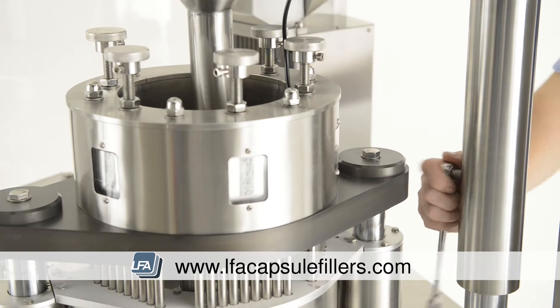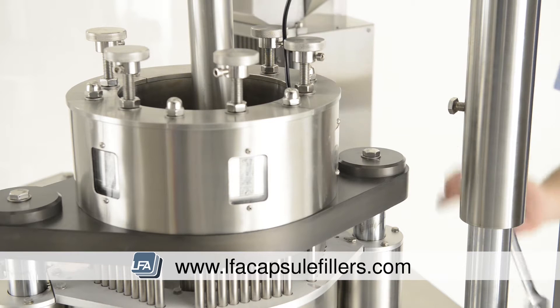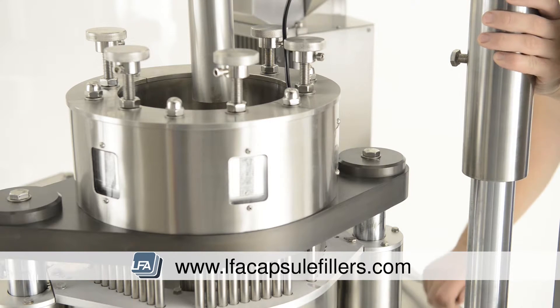First, loosen the bolt on the side of the top section pillar. This will allow you to raise the top part of the machine and remove the hopper. Once raised, re-tighten the bolt.